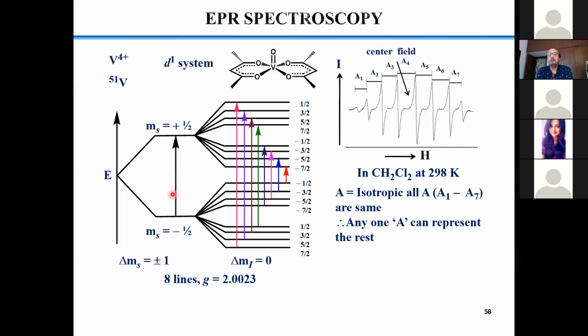Now you see the very standard example that we always try to do in this experiment for our MSc class, first year MSc class, that for ESR respect, this is one of the compounds where you will never miss the ESR. At room temperature, at low temperature, forget about Q band, X band, always you'll be getting a beautiful spectrum.